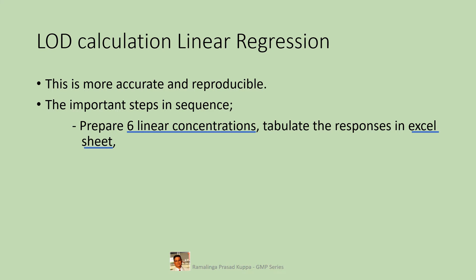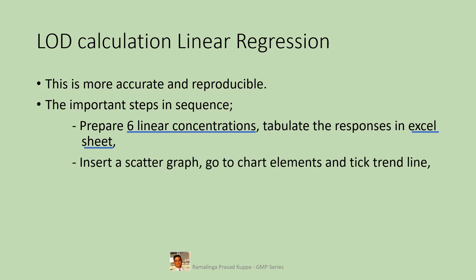In an Excel worksheet, insert a scatter graph. Go to the chart elements and tick the trend line. This is simple to do — go to the Insert tab in Excel and select the scatter graph option. Now you are set for data generation.